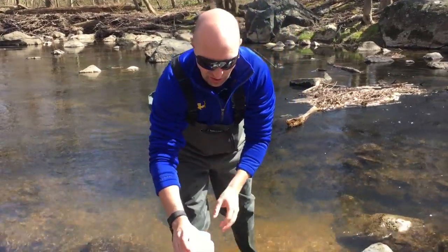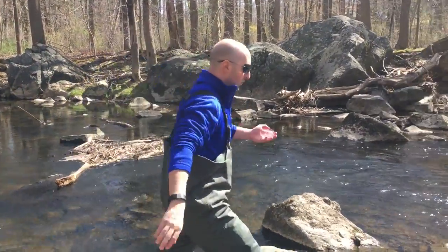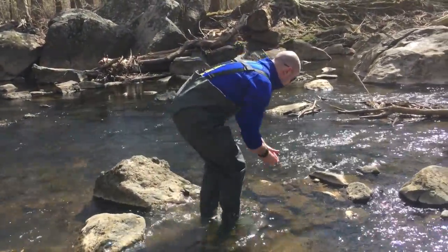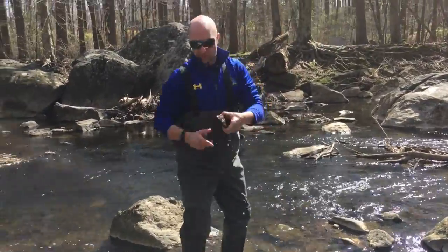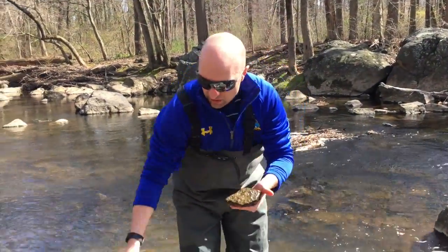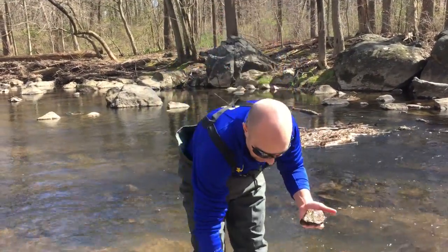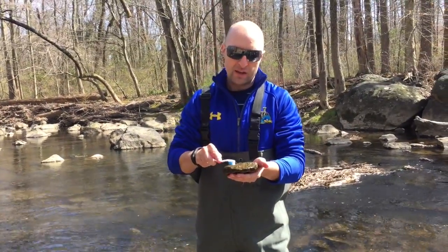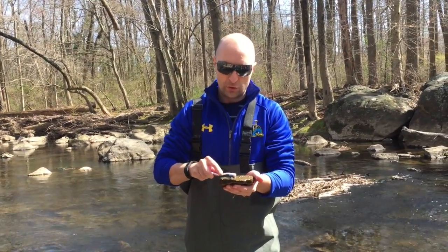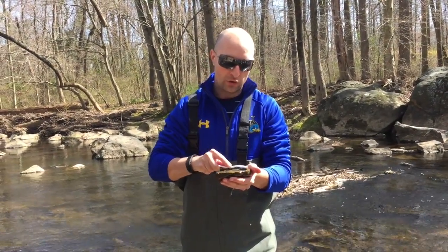The next thing I'm going to show you is how to sample from a rock. Find a good rock with a good flat surface that was facing up. The next piece of equipment you'll need is a toothbrush. Give your toothbrush a rinse in the river, then carefully and gently move the toothbrush on top of the rock as if you were brushing your teeth. Go in small circles.